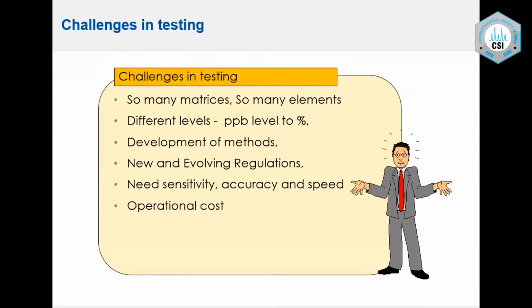So what are the challenges in testing? If you have different kinds of samples, how do you proceed with the analysis? You will find there is a variety of samples and matrices, which contain so many elements. The level of elements varies from ppb level to percentage level, from sample to sample. So it is a very critical job to develop a method, because there is no single method available for all the products, and you need to optimize and validate the method for different matrix samples.